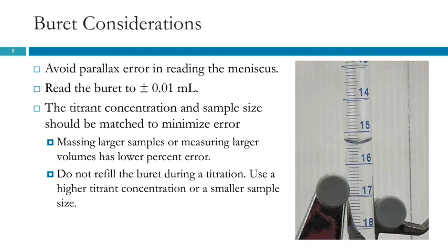So here's a photograph of a meniscus in a burette. And if you'll notice at the 1 milliliter markings, that line goes all the way around the burette. That's actually for a reason. So see how this line for the 15 lines up almost perfectly? That means I'm looking straight across. They are lining up with each other. This one isn't quite as good, but almost. And so this one's lining up. That tells me in this part, I'm looking straight across, because this meniscus is in the middle of the burette. It's not at the edge.